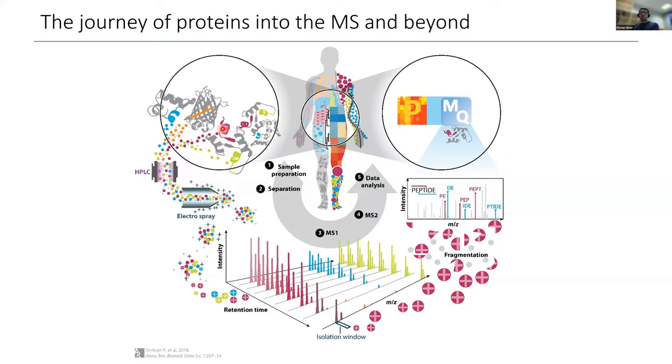Before, we heard the term bottom-up and top-down proteomics. Our preferred method is the bottom-up approach. And in this case, we would not stop at the protein level, but perform a proteolytic digestion that cuts our proteins into peptides. The reason for that is that peptides are much easier to analyze than intact proteins. And, you know, we can, for instance, use regular C18 reverse phase chromatography to get a nice separation of these complex peptide mixtures that then come out of this process.